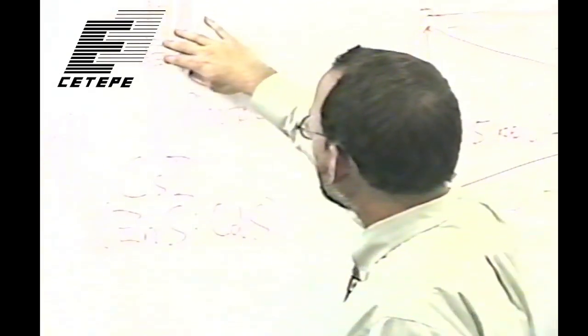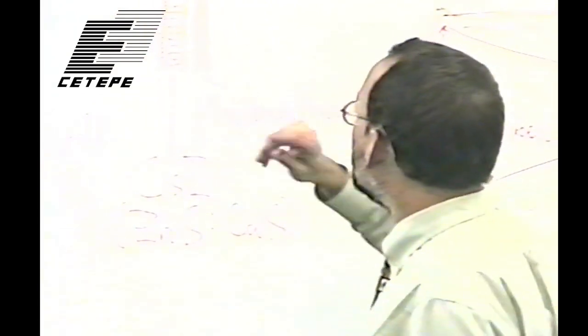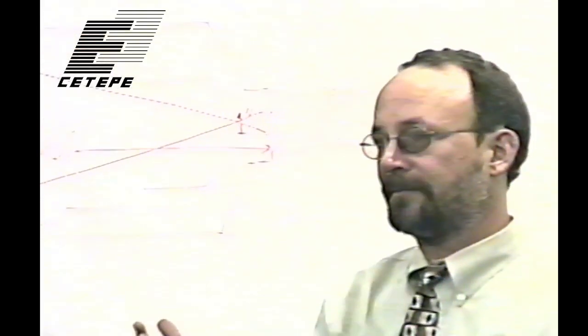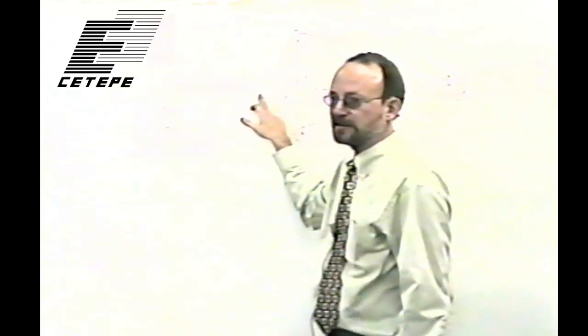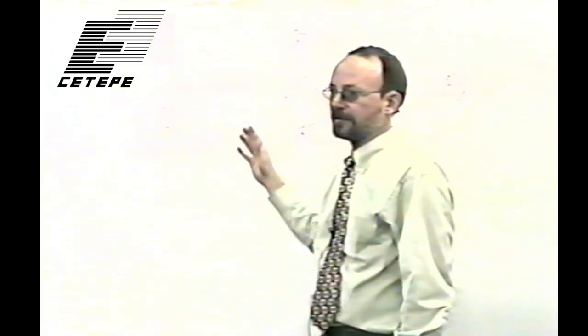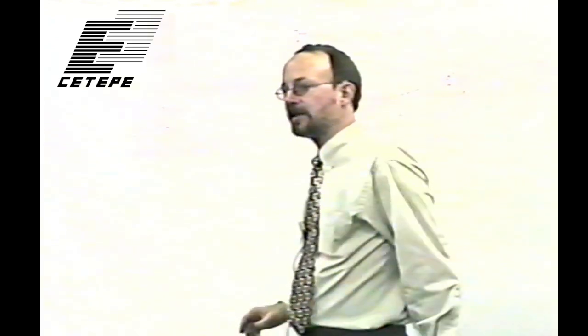Then after the X-rays are converted to visible light, and that's a process where, for instance, a 100 keV X-ray would produce several thousand 2 to 3 eV light photons. So there's a huge multiplication right there. Then there's a very inefficient stage where it takes roughly 150 of these light photons incident on the photocathode here. Photocathode means light to electrons. So it takes about 150 visible light photons to create one electron off the photocathode. So there's some loss there, but you still have more electrons than X-rays.